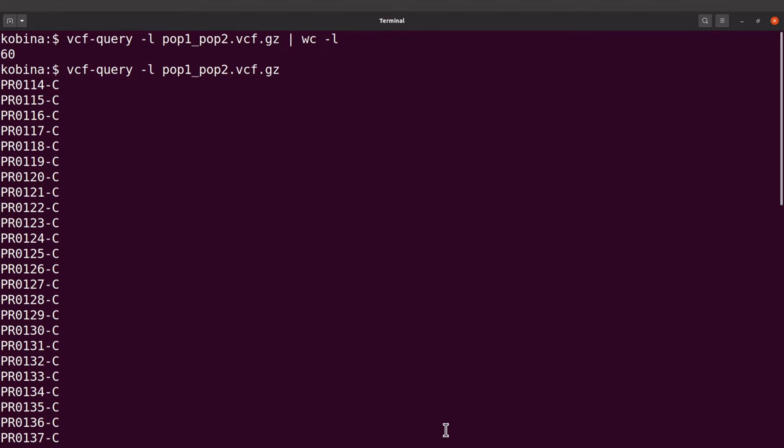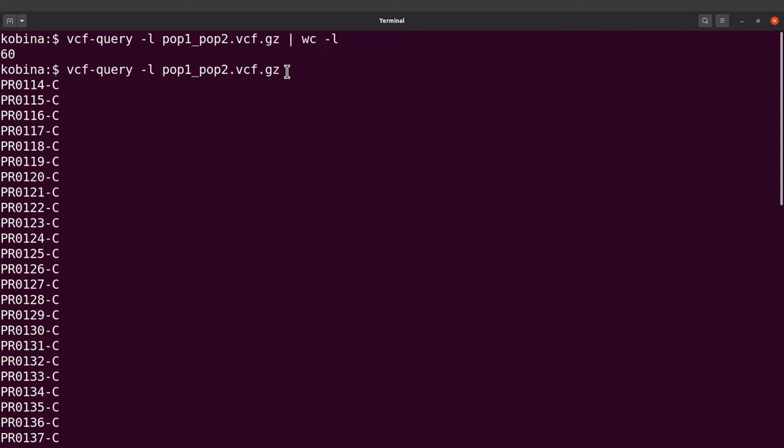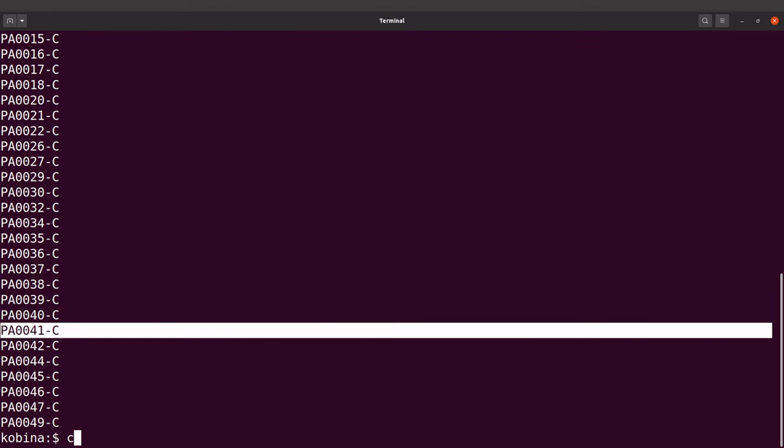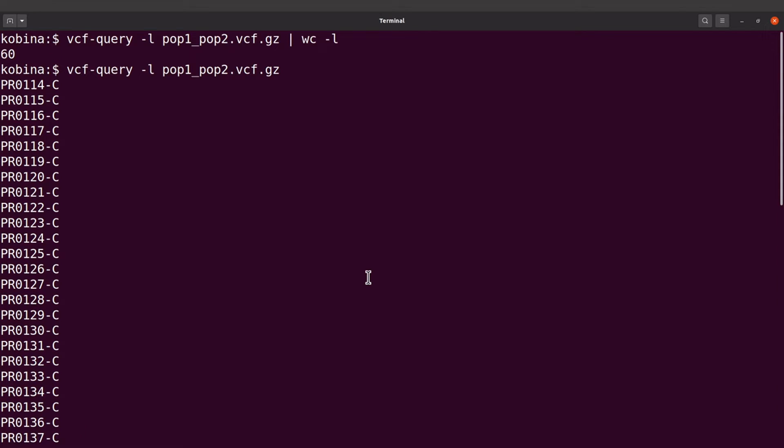So the samples for isolates taken from the Gambia will have to be in one file and then those taken from Bangladesh also have to be in a different file. And this should be text files. So we are going to use some one-liner commands to get these sample names or sample IDs into their respective files. I'll label them as pop one and pop two so that they match this VCF, but you can use any name as well. So I'll start with PR first.